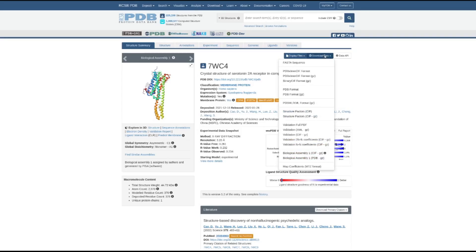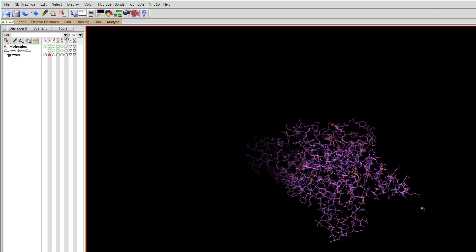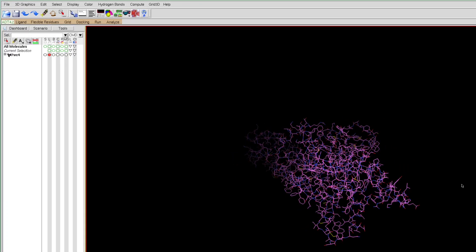Once we have the protein complex downloaded, we'll want to look at it in AutoDock Tools. To do this we'll press File > Read Molecule, then navigate to the location of the receptor. Here I have it labeled 7wc4.pdb. We can open it and now visualize what the receptor and ligand combination look like. We might want to have a better idea of where the serotonin molecule is in the receptor.